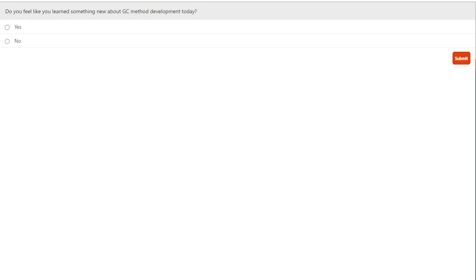Okay, great. Next question. When we are considering concentrations to decide between split and splitless injections, are we focusing on concentrations of anything to avoid damaging the column, or only focusing on the concentration of interest?